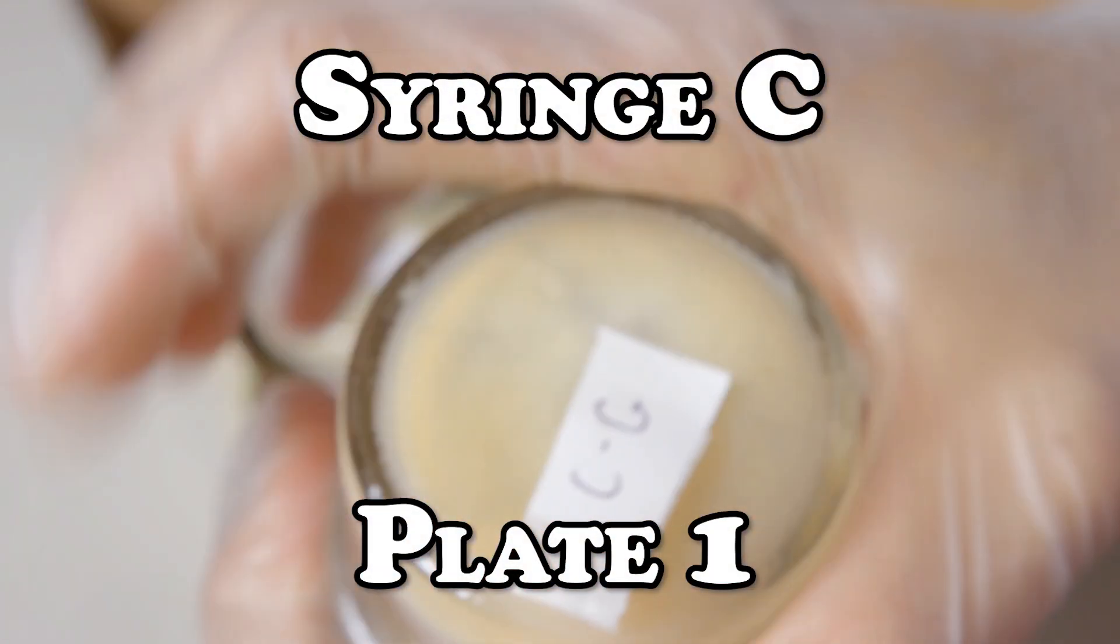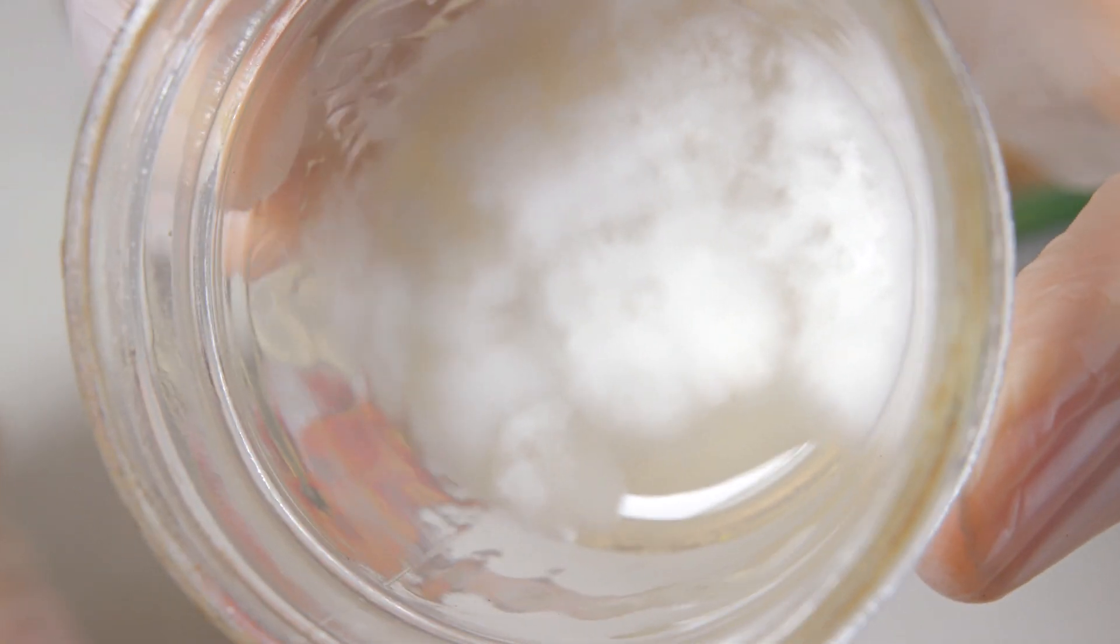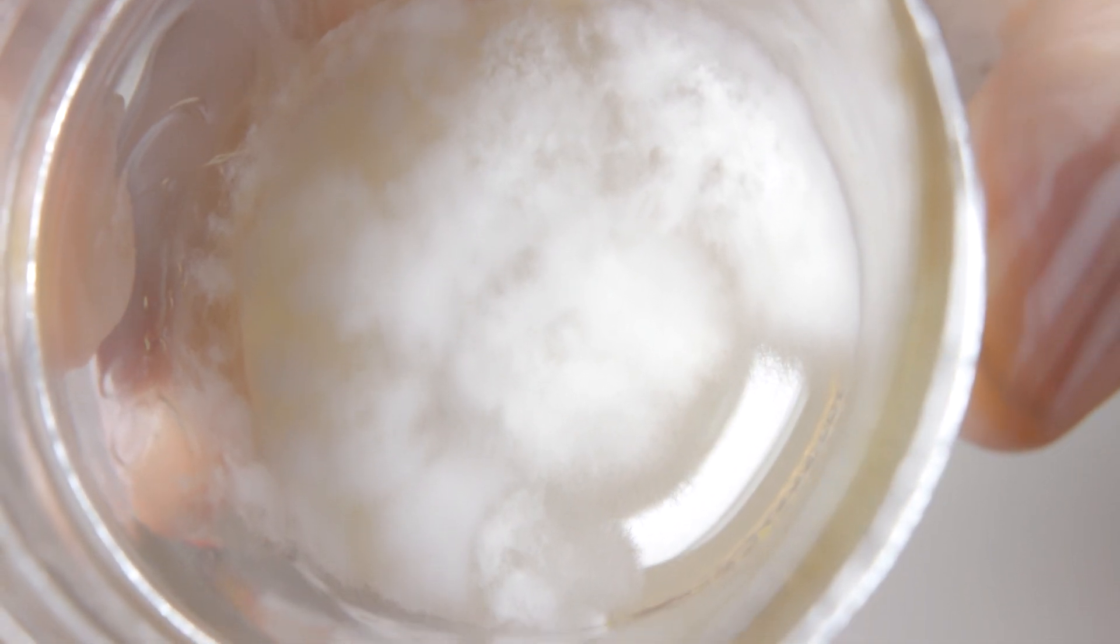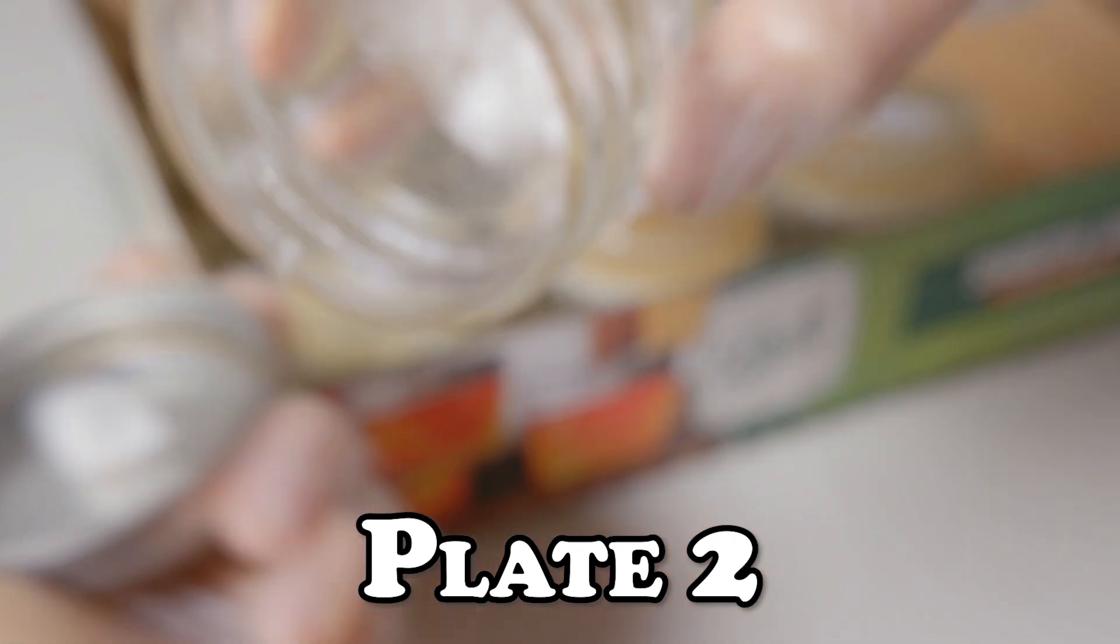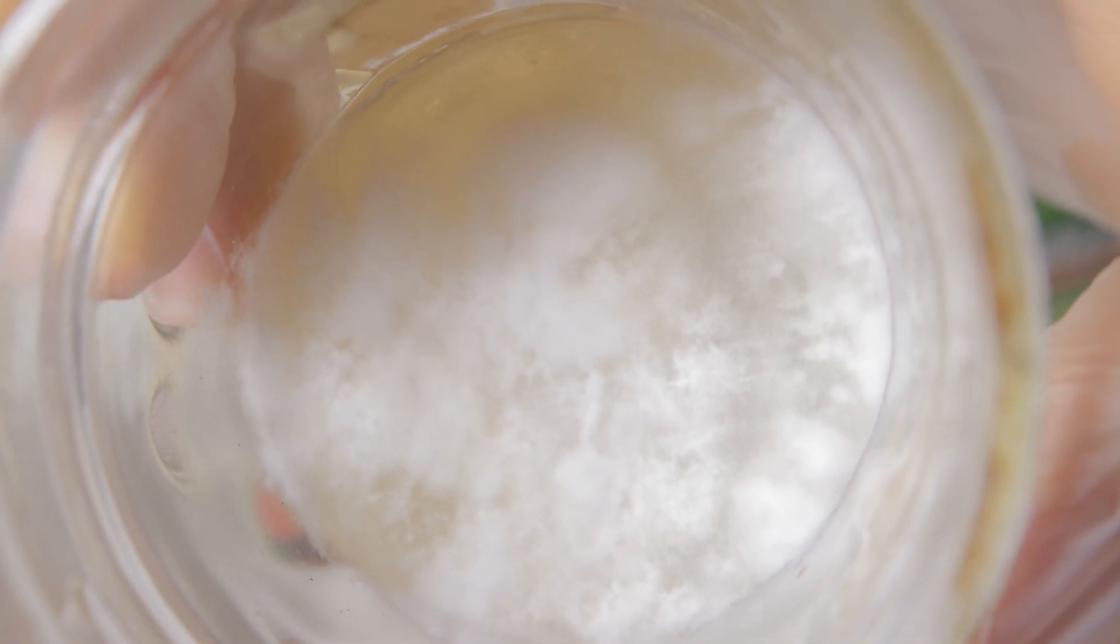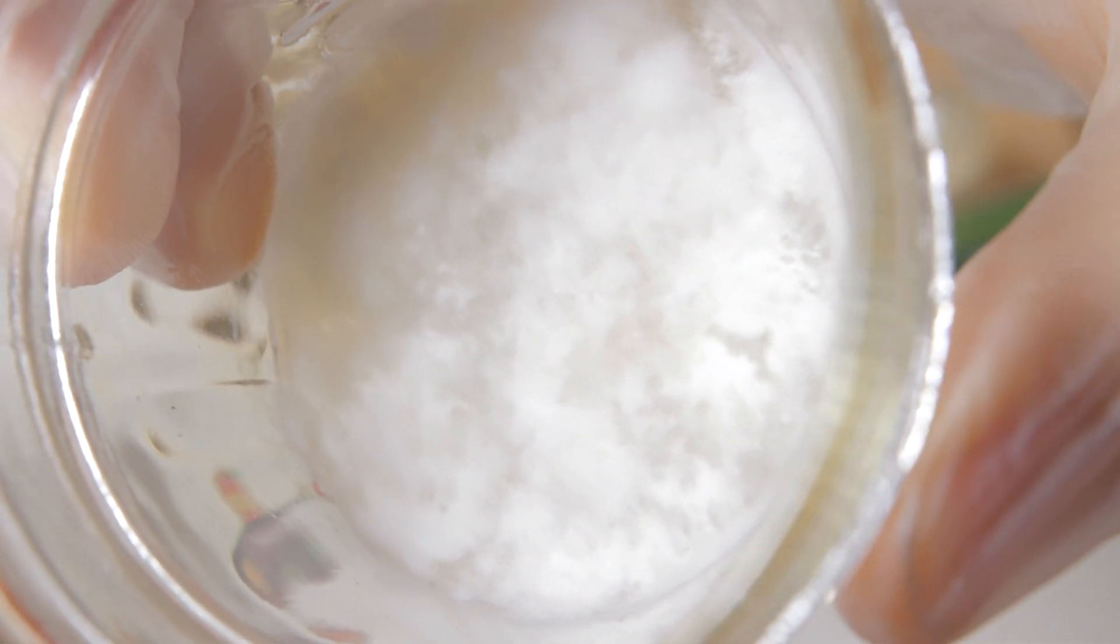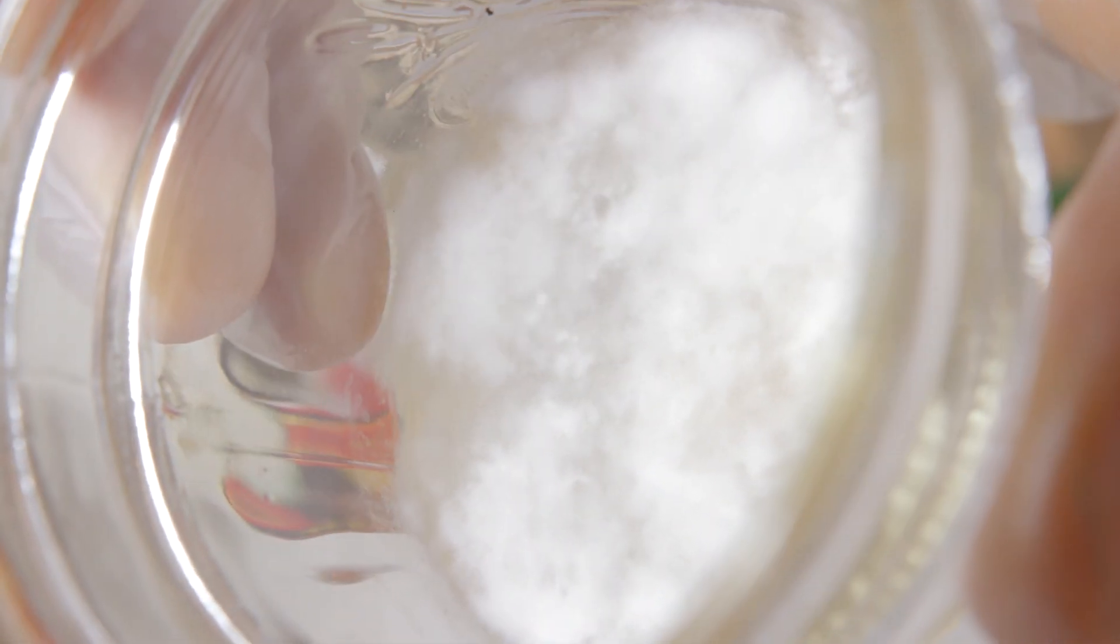Now to finish off strong with our last set, syringe C. Here's the first plate. It looks like we have a lot of mycelium on the plate, but perhaps there's some bacteria we can find. To my eyes I don't see any, which is great, but it is possible that some mycelium has grown over it. Overall I'll count this as a win. Moving on to our second plate, we do see a lot of mycelium and don't notice any bacteria. We'll count this plate as a win as well. Time for our third and final plate, and I'm feeling pretty positive about this one, and it looks great. Beautiful mycelium throughout, no indication of bacteria. We can simply take a transfer to a non-treated plate and continue the process. We'll be posting a separate video showing the continuation of this isolation process using agar plates.